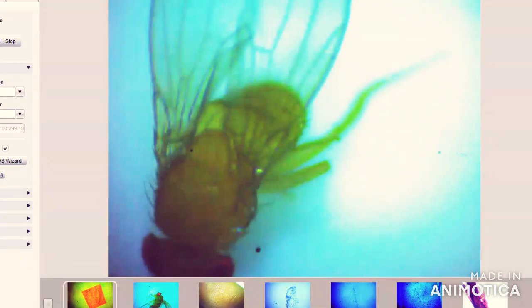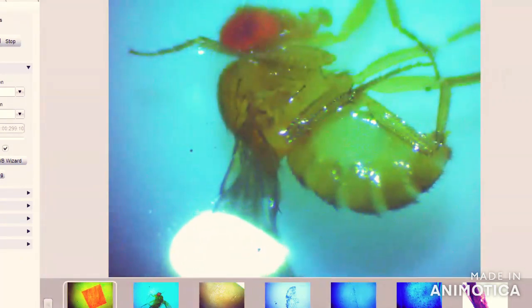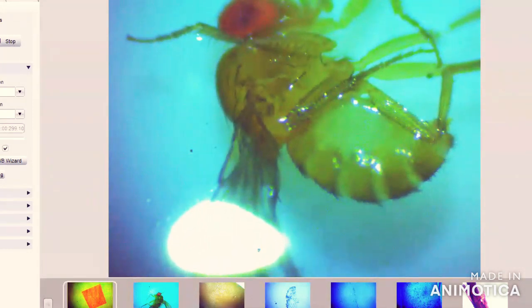Here we have another one, this is the side view of the Drosophila. As per the third chromosome group mutant, Morgan and Bridges, since the work on Drosophila has been initiated from 1909 and 1910, mainly by T.H. Morgan and his colleagues, about 400 mutants have been found.